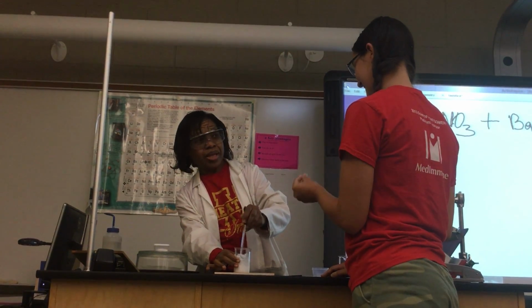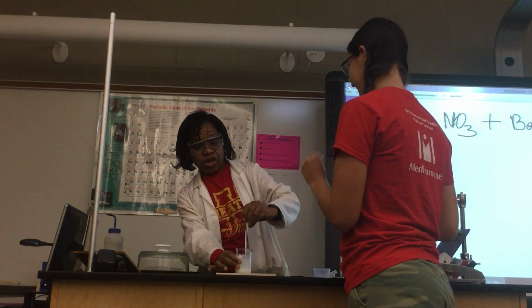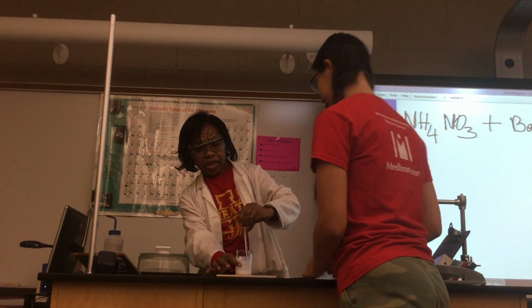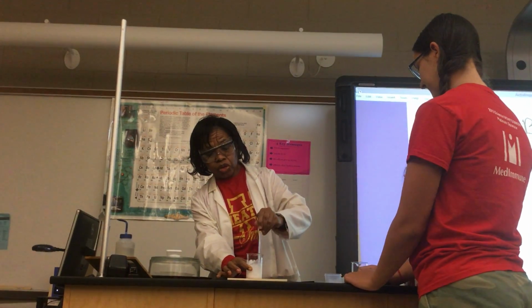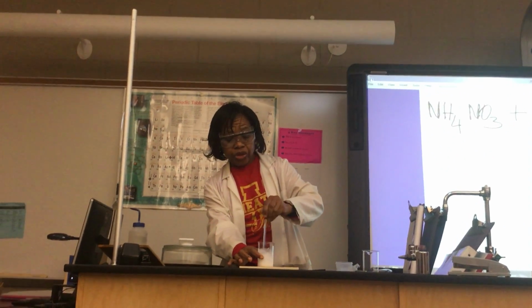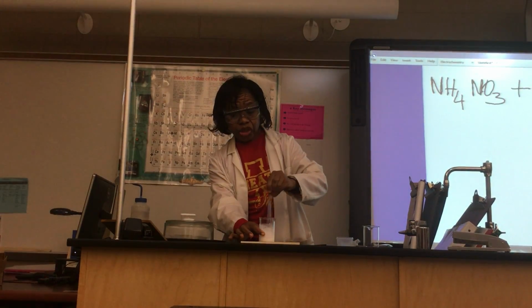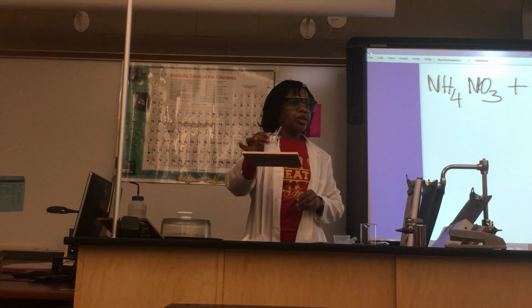It smells almost powdery. Is it a strong smell? Yes. How about the state? What do you see? What is the state? Liquid. Okay? So now it's turning completely into a solution. So you feel it? Okay, thank you. I'm going to measure the temperature of that liquid. We start with 2 solids. 2 solids. All right? And this is what happened.